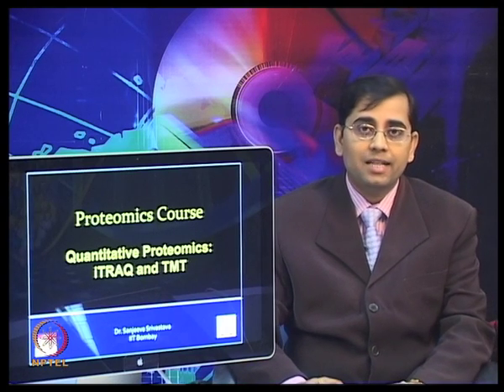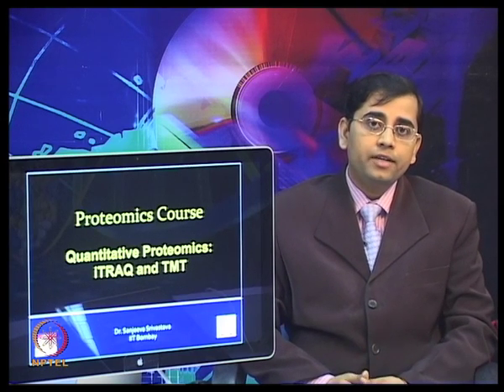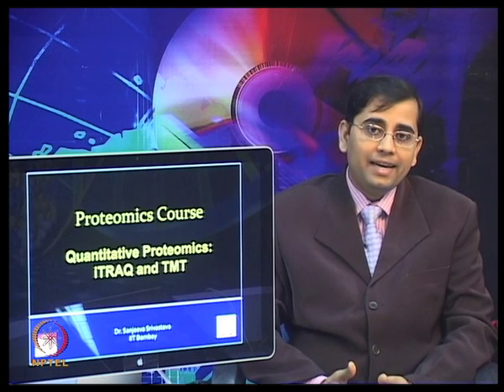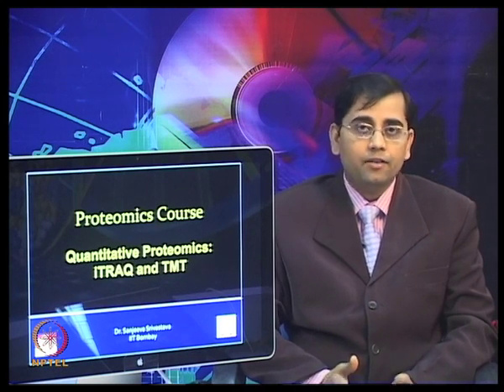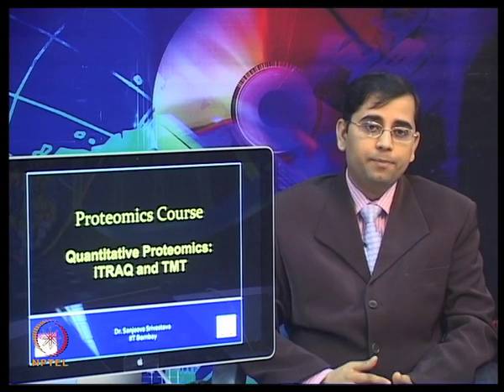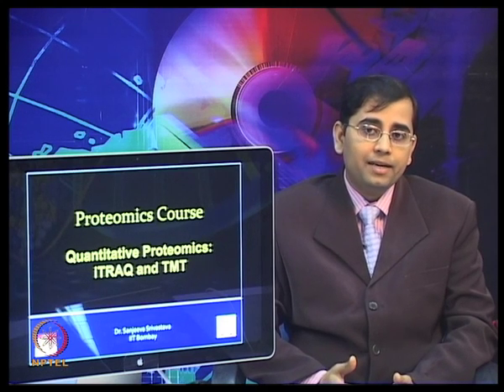could be analyzed from this approach, new approaches came considering sample multiplexing, because one limitation of ICAT was that only two labels are available. Therefore, more samples cannot be compared in a given experiment. So, there is a need to compare a large number of treatments.